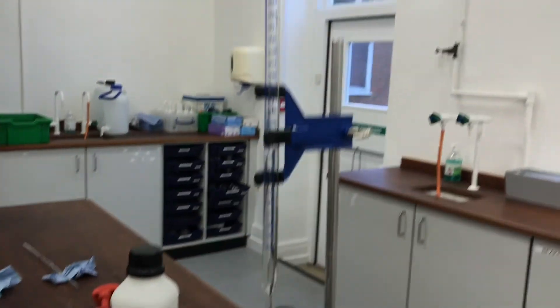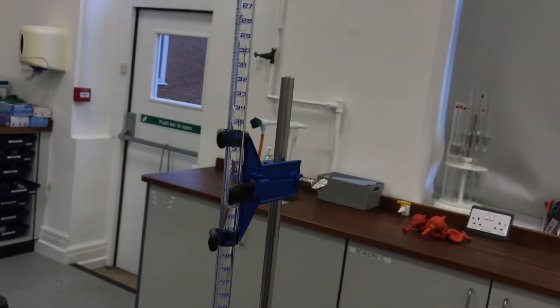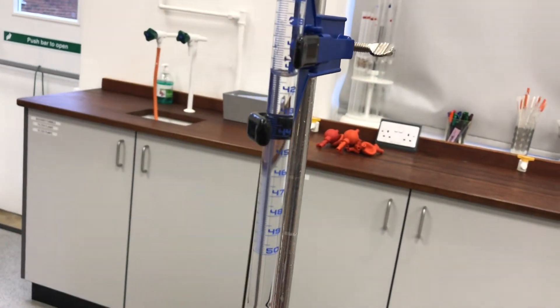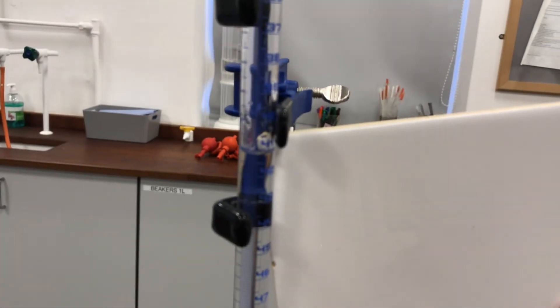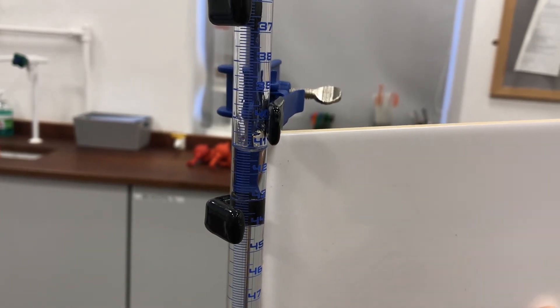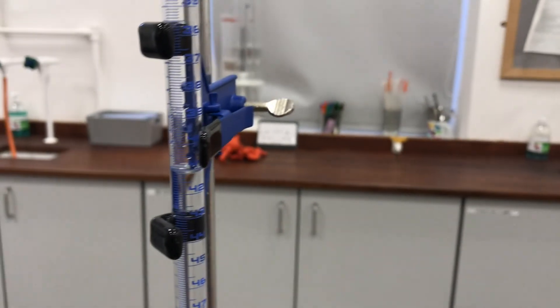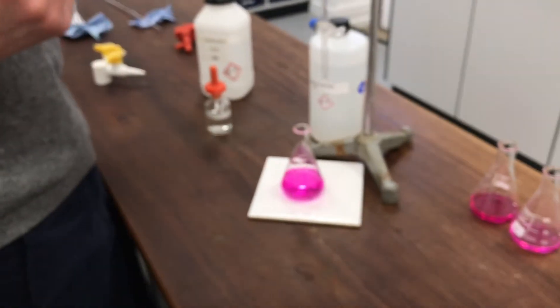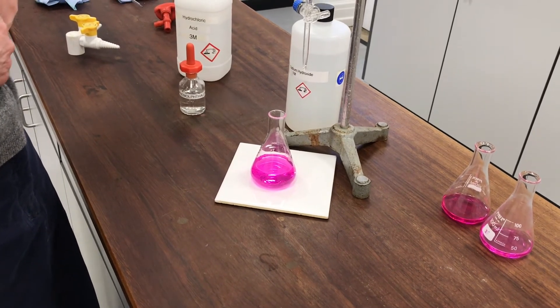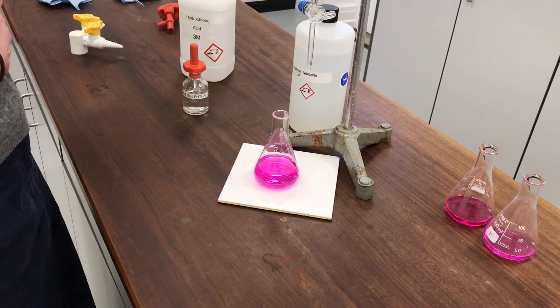From my burette - that's a bit difficult to read, let me put the white tile in behind. I think it's 41.25 - I'll record that. I'll titrate all the rest of the mixtures and show you the results at the end. I don't think you need to see all eight titrations.